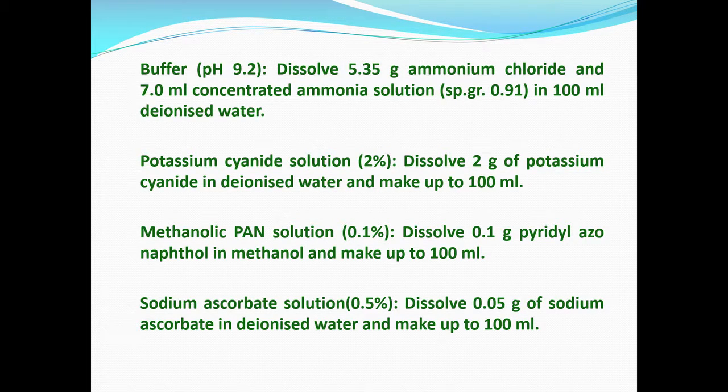And the potassium cyanide. Usually people do not like to use potassium cyanide as a chemical reagent in the laboratory because it is very dangerous to use, but sometimes it becomes necessary to use such chemicals as and when required. That is the speciality and hazard of the laboratory also.